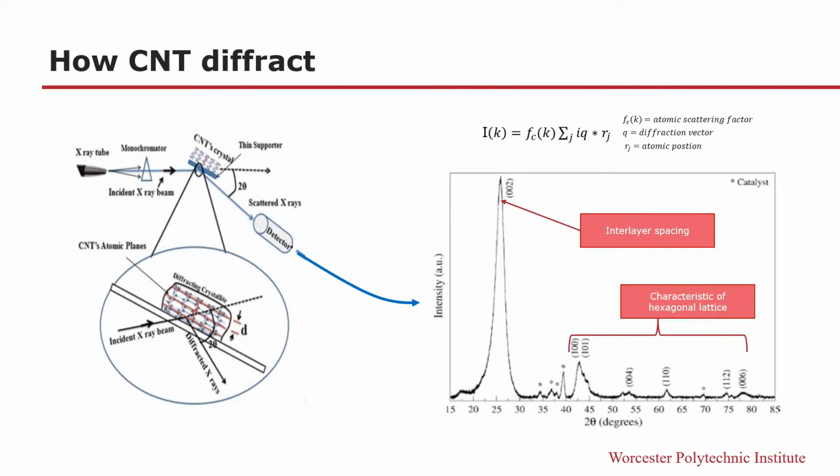Although carbon nanotubes are often referred to as non-crystalline materials, they are far from amorphous. The repeating hexagonal carbon pattern means that the diffracted peaks from the carbon atoms can be used to determine specific details of the nanotube, if the results are considered as aligned graphene sheets. X-ray diffraction results can be predicted by considering the scattering of multiple carbon atoms, which has been well studied, and applying it to a helical structure, using the equation form shown here. Since the carbon nanotubes are highly directional, the orientation and morphology is critical to the results of the diffracted peaks.